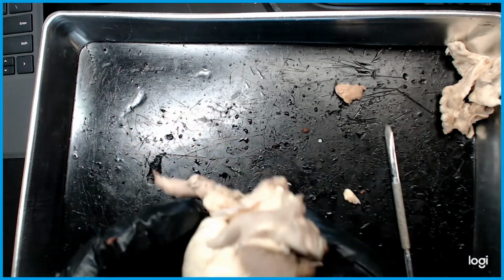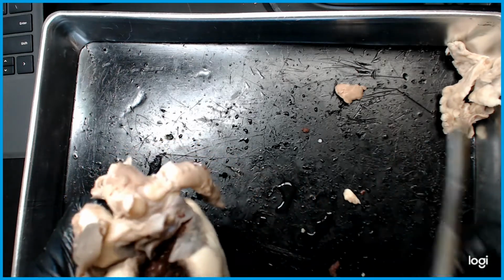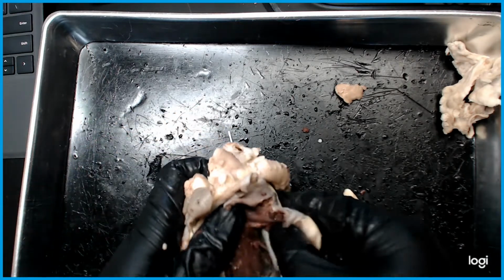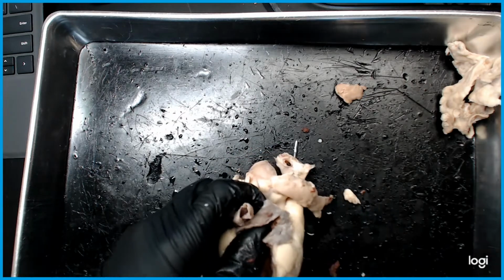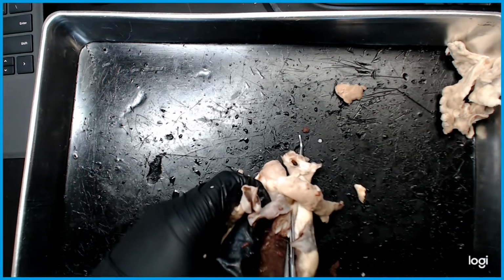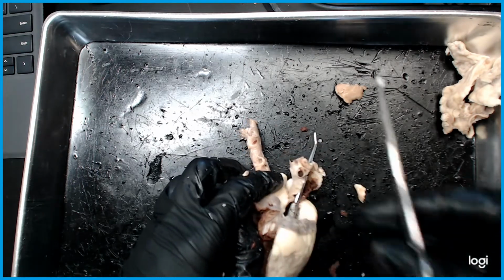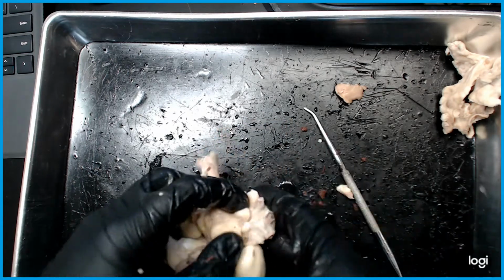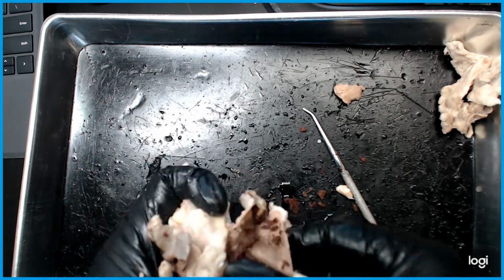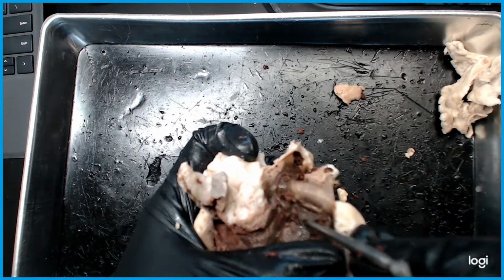Okay, so now what we wanted to show you, now that we went ahead and opened this up, I can show you the pulmonary semilunar valve. Just to make sure we didn't destroy any other portion of it, we can come back to this. Let's go ahead and place our probe as a guide. And now we're going to finish cutting through here. So yes, we're going to cut a little bit through the atrium because that tissue is in front, but we want to follow the probe to ensure that we are going through the right portion of this dissection. When we open it up, there it is. Pulmonary semilunar valves, right there.